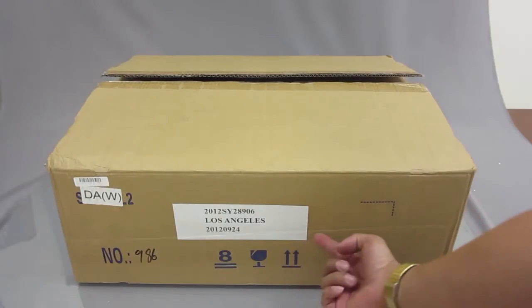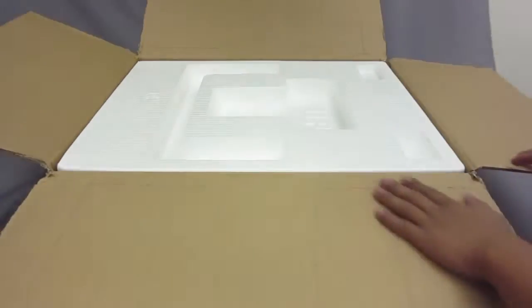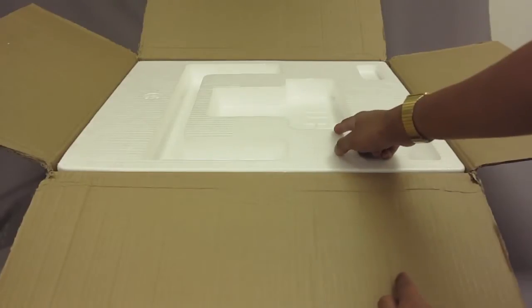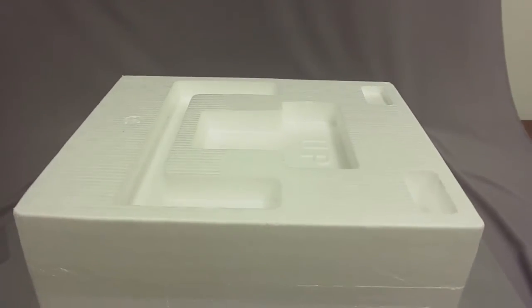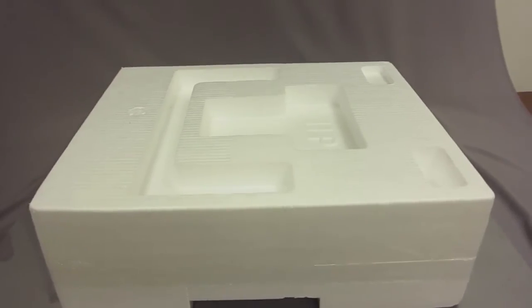If you look at the arrows on the box, they are facing up. Go ahead and open it up. After you open it there's going to be styrofoam. Make sure you open from the top — the very top of the styrofoam is going to say 'up.' When you get the styrofoam out of the box there's going to be tape around it, so just go ahead and remove that.